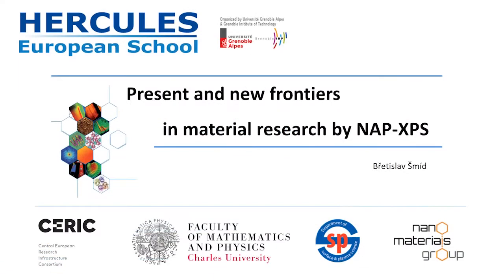I'm happy to present to you today our facility at Charles University, the near ambient pressure X-ray photoelectron spectroscopy. My talk is named Present and New Frontiers in Materials Research by Near Ambient Pressure XPS.